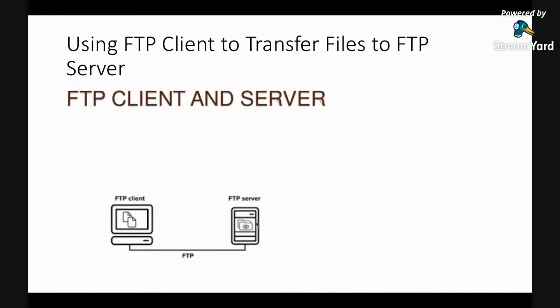Let's look at the FASTQ file that you are going to use today. Before we look at that file, we will look at it in Galaxy. But just to introduce to you, I did not put a slide. The FASTQ file that I have given you is of RNA-seq data from zebrafish beta cell. You will see that it's only a few kilobase. That's because it only has 1,000 reads. Initially it had millions of reads, but I truncated it to only 1,000 reads, just so that we don't take too much time today analyzing it.